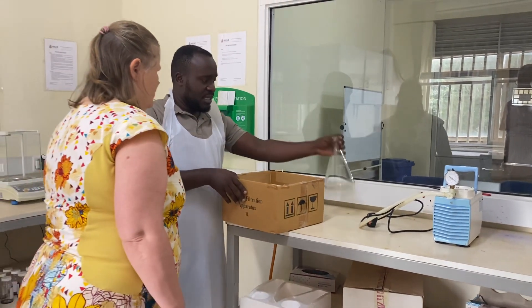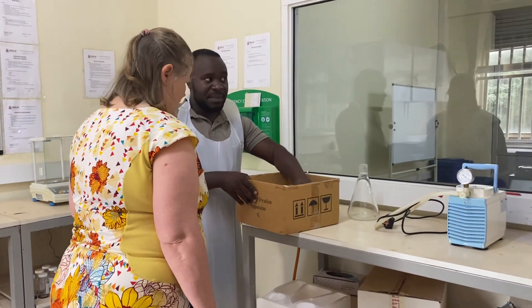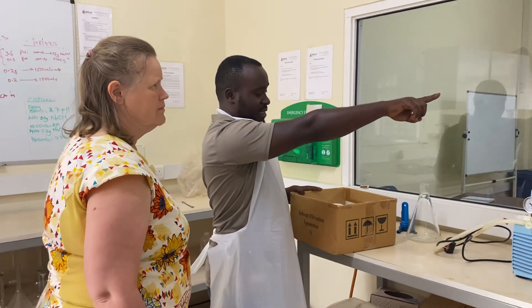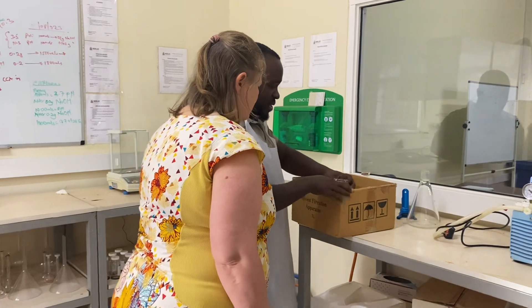This is the water filtering system — the membrane filtration apparatus. Like you can see with this other procedure there, this is the membrane filtration apparatus that we use.